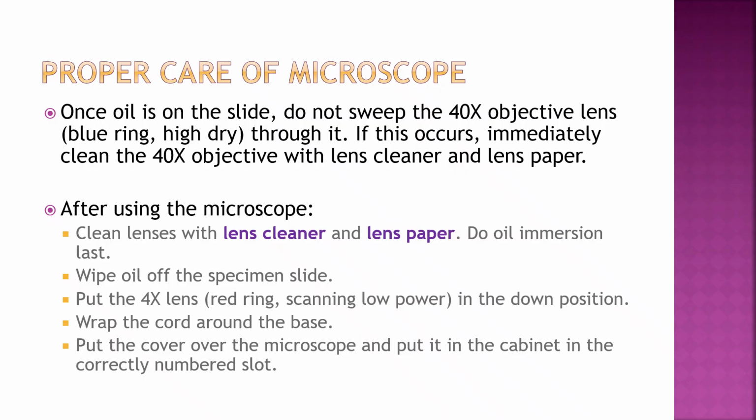Obviously, if you're in your own lab somewhere, you wouldn't do that last part, but you would cover the microscope. And I can't say this enough about covering microscopes. Don't leave microscopes uncovered for any length of time. They collect dust like a magnet. And it won't take very long before you're not getting good, accurate viewing because of the dust. So even in a laboratory, if you leave for the day, you want to make sure that you cover your microscope with its microscope cover. That will prevent dust from settling.